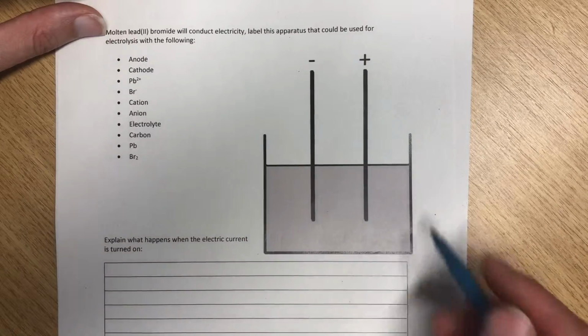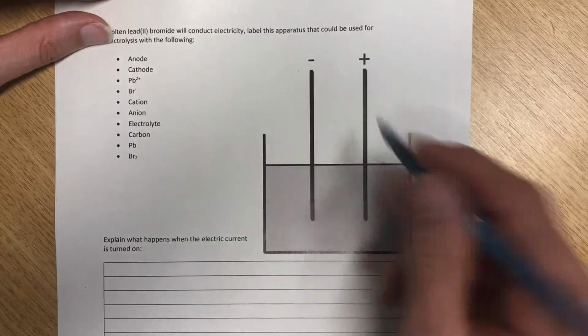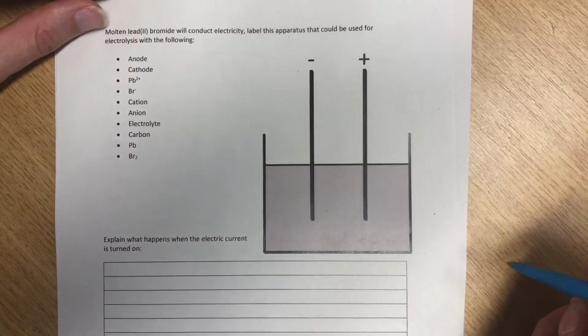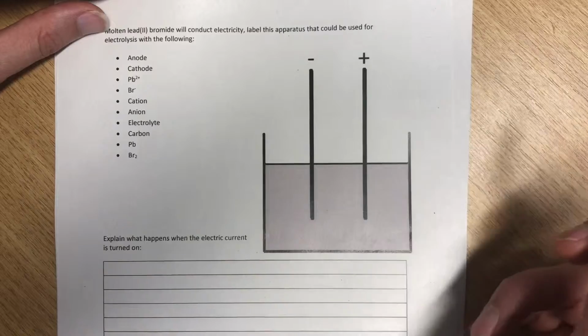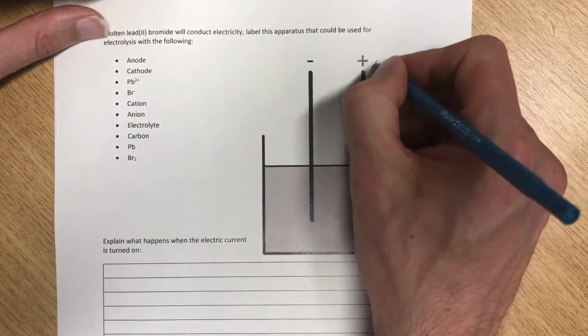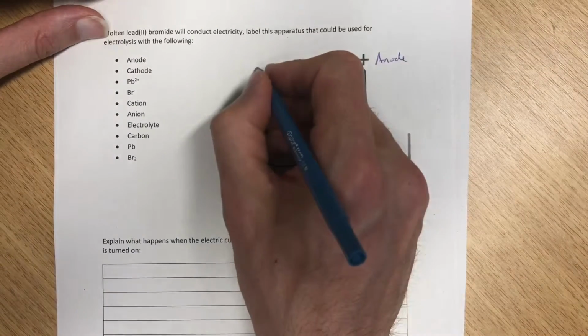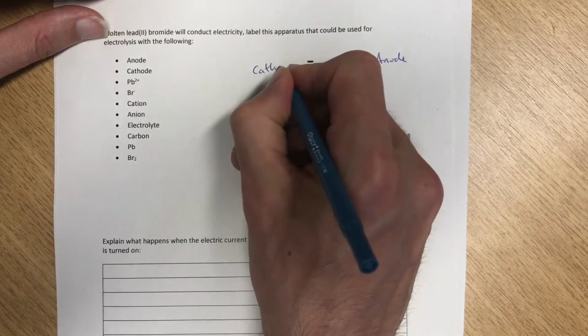What apparatus do we need? We need a beaker to put the lead bromide in, and we need to put 2 electrodes into it. Now, electrodes have names. We have a positive electrode and a negative electrode, and we call the positive electrode the anode. And that's what we always call a positive electrode, and we call a negative electrode the cathode.